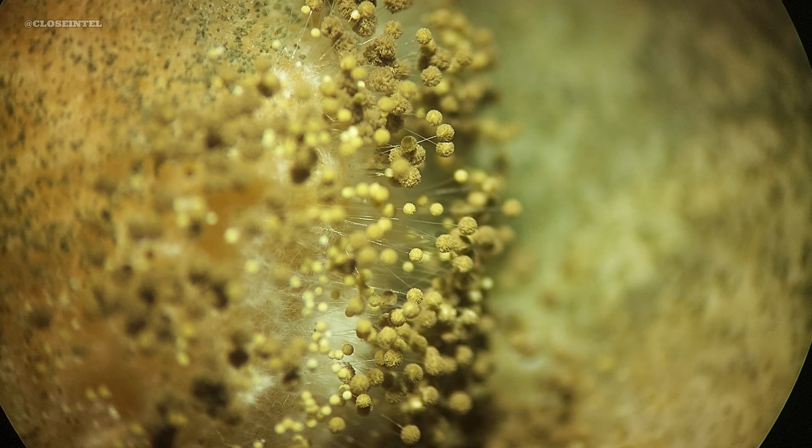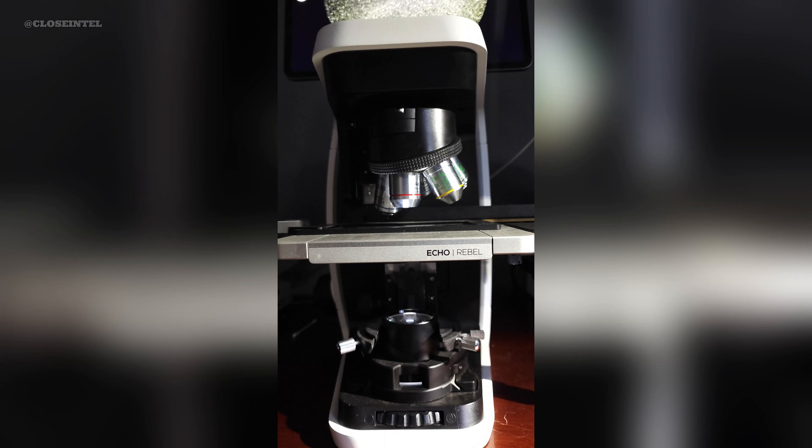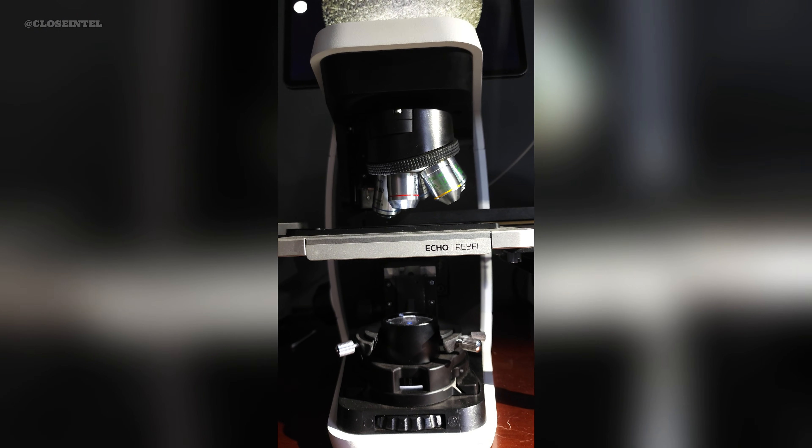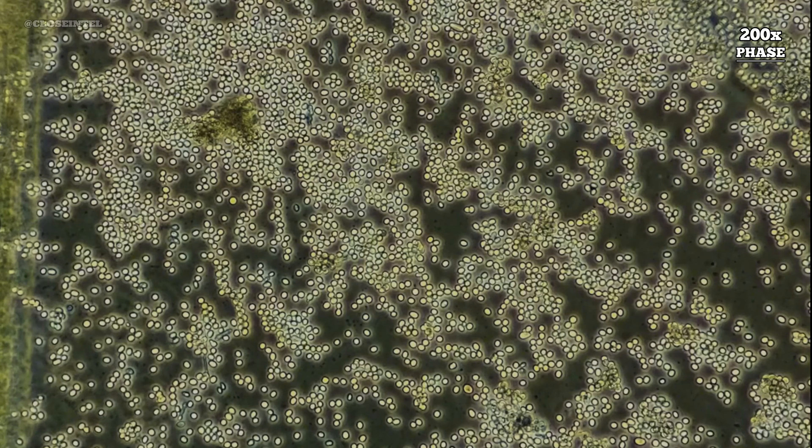That being known, I grab some with my tweezers so we can observe some samples at an even higher magnification under a microscope. Most of the sporangia burst open and began releasing spores all around the slide, which are the spherical and ovoid shaped objects on the screen.